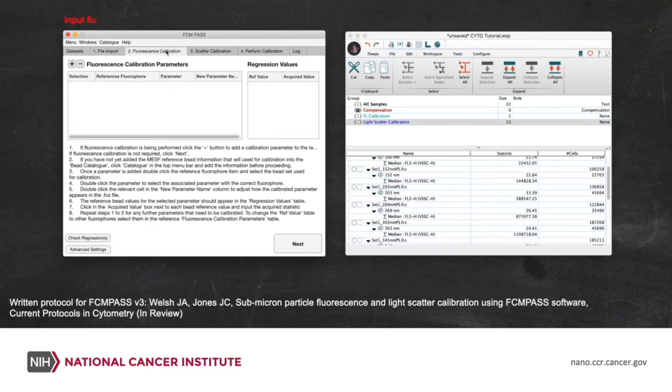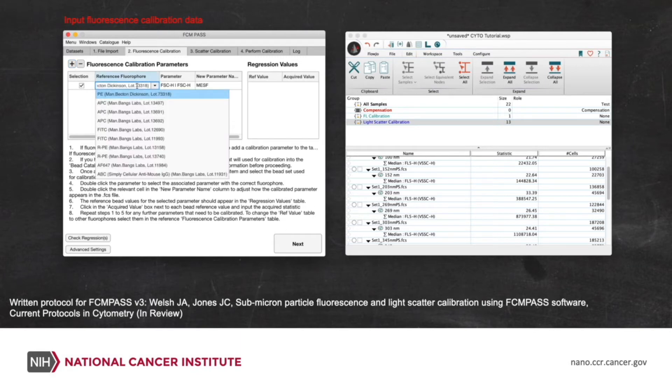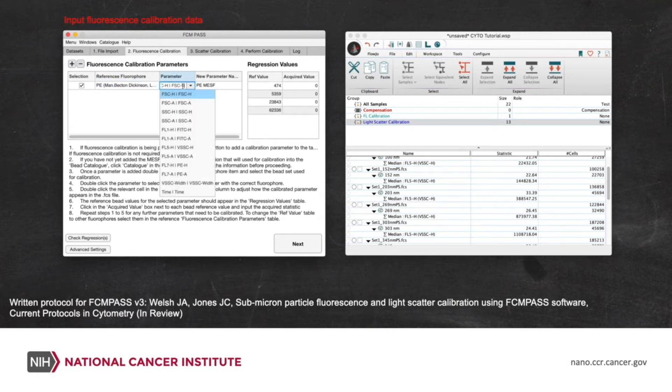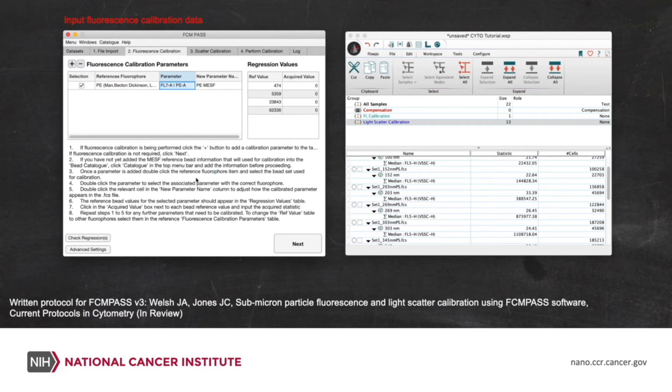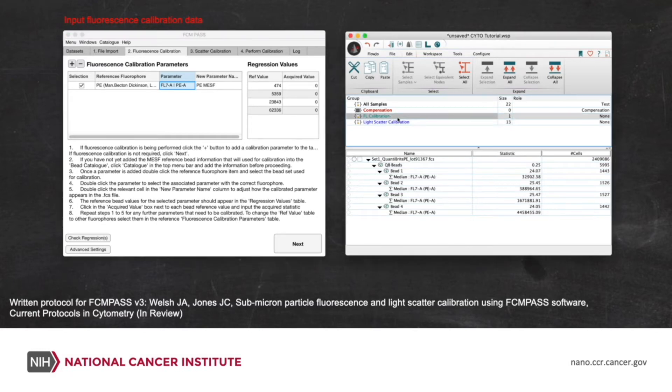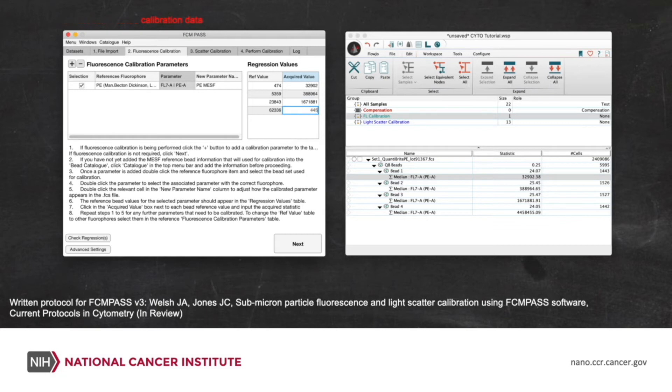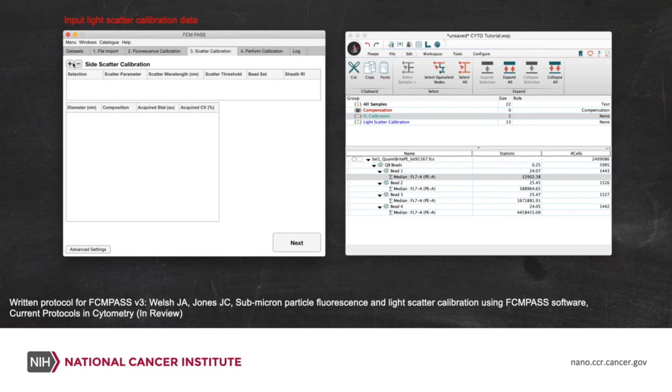Now that that's done, we'll move on to adding a fluorescence calibration. We can add as many of these as we like. So from our catalog, we'll pick that we want to perform a calibration using these PE-MESF beads. The Quantabrites, you can see that their reference values have appeared on the right. We now select the channel that was relevant for those PE beads. And now we'll go to our data and put in the median statistics for each of the populations for the PE channel. You can see that the parameter name there we've left as the default, which is PE-MESF, but you could also edit that. In the advanced settings, you can also change the FP ratios.